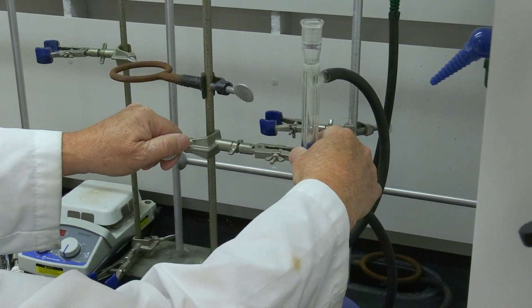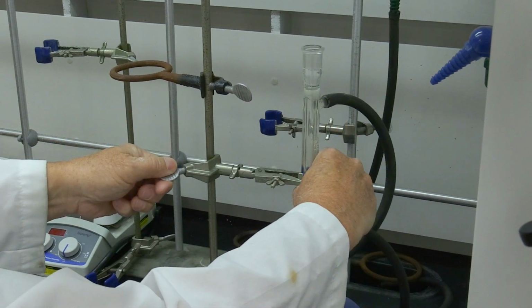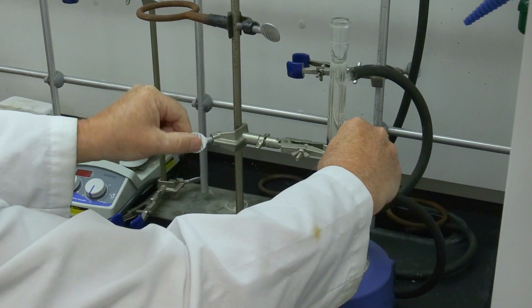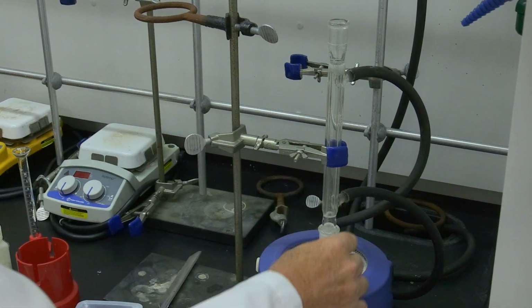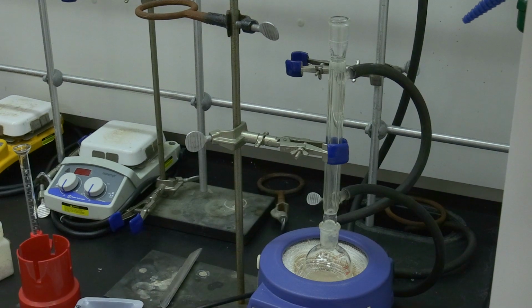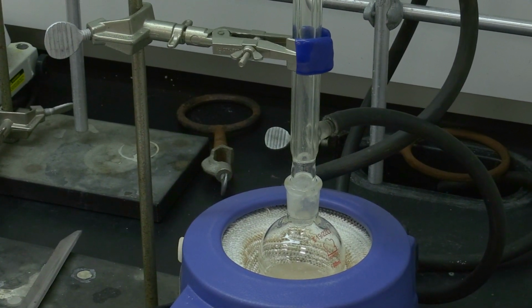And now we can attach the reflux apparatus to the flask and wait until we get reflux and then start counting the 60 minutes.